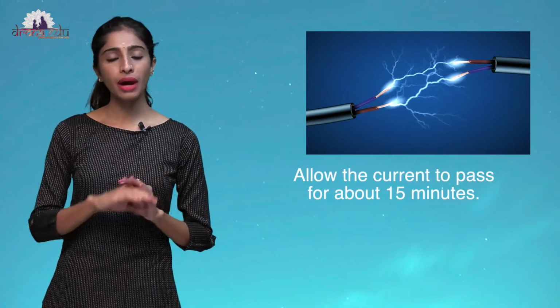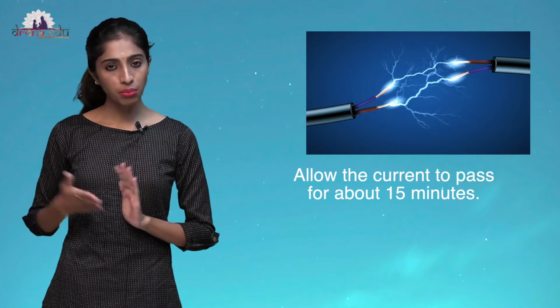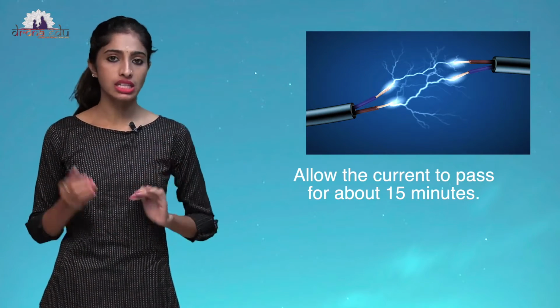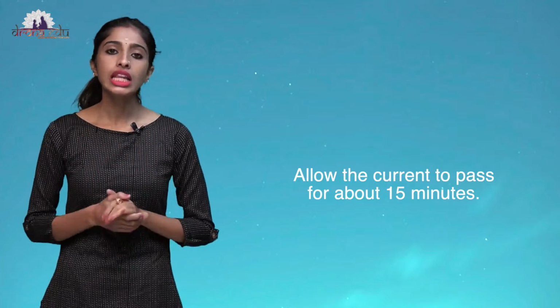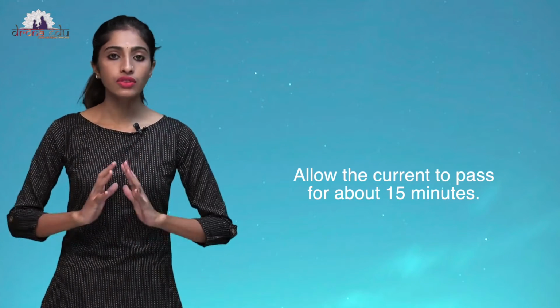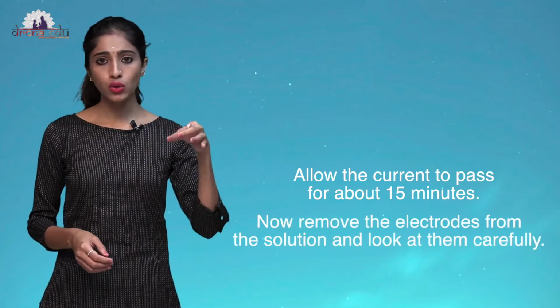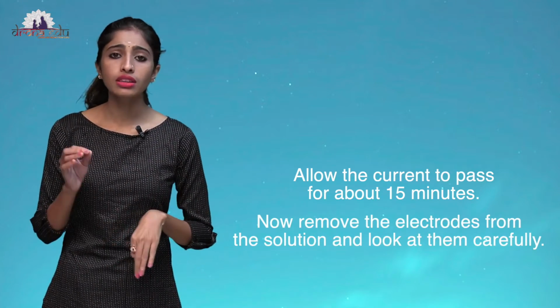Did you understand? Now the circuit is complete and the current will be passing through it. Leave this circuit for 15 minutes. Now remove the electrodes from the solution and look at them carefully.